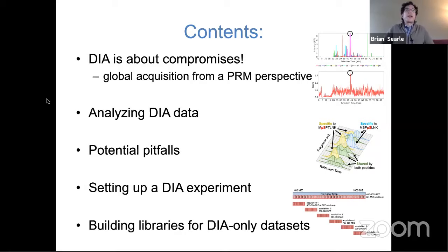So how accurate is Prosit? Because it was built for Orbitraps. And is it accurate for other types of Orbitraps? Because it was designed around Lumoses, for example. And then also, does it work for other types of QTOF instruments?